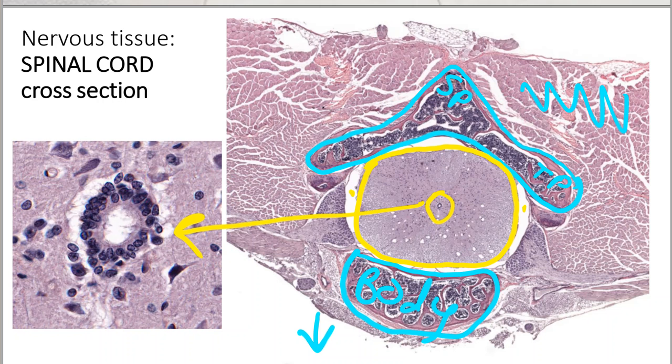You're looking at these particular cells, and they have a little bit of cilia. Those are the cells you have to identify on page 1 of your lab report, and then understand the function of those cells. You can find all of that in the first page or 2 of your lab manual.